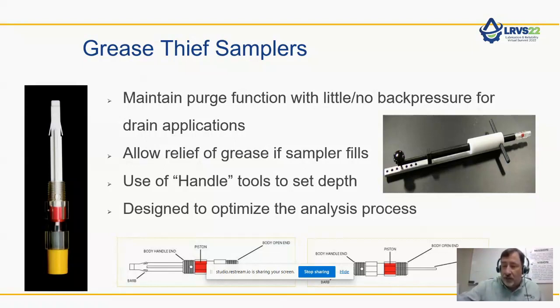It is just a few centimeters long, and it holds a little more than a gram of grease. That's the target volume. We want to catch 1 gram of grease on its way out of the machine before it touches the outside of the machine, before it lands on the ground, before it mixes with other materials that are not representative of what's in the machine.